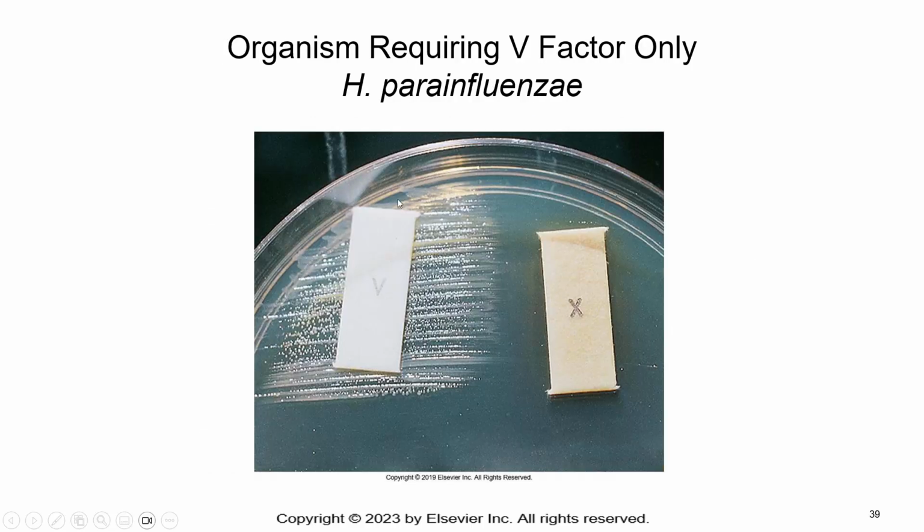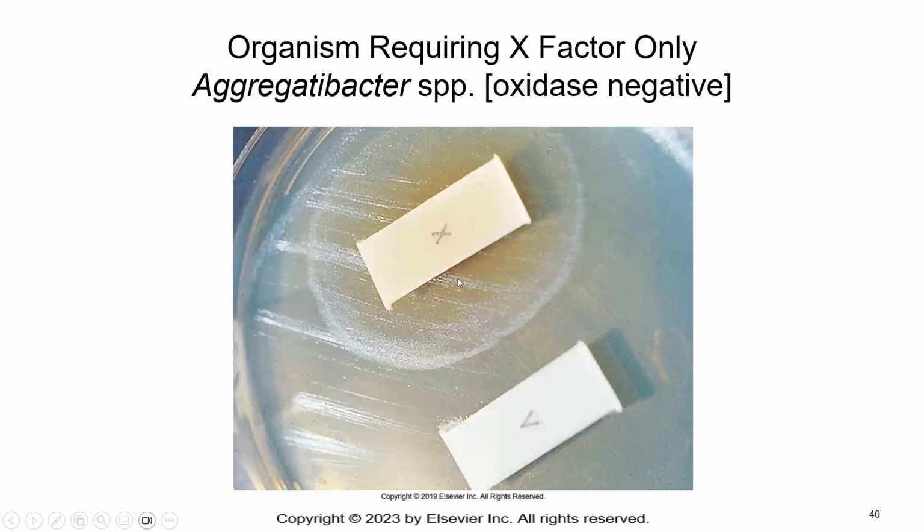So this picture requires V, and this picture requires X. If you are shown pictures on the test, you should be able to identify what factors it requires.